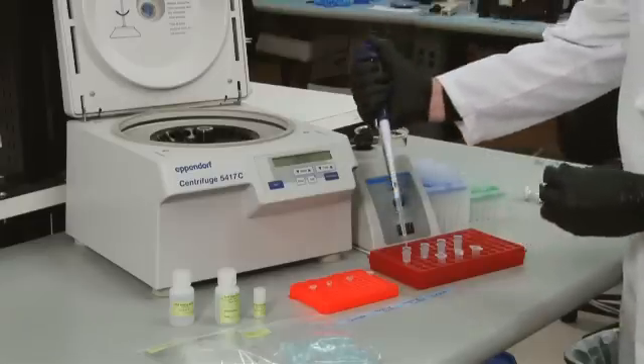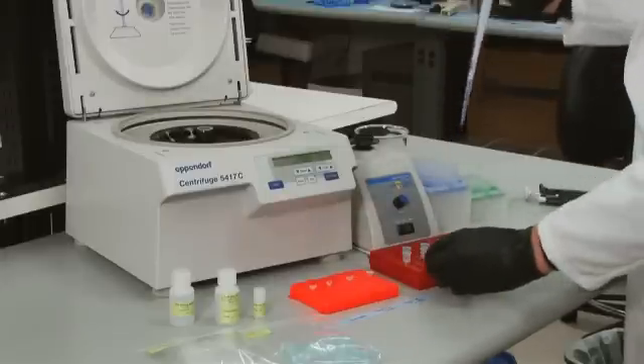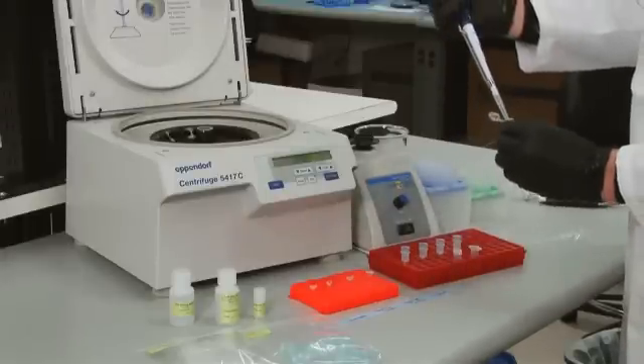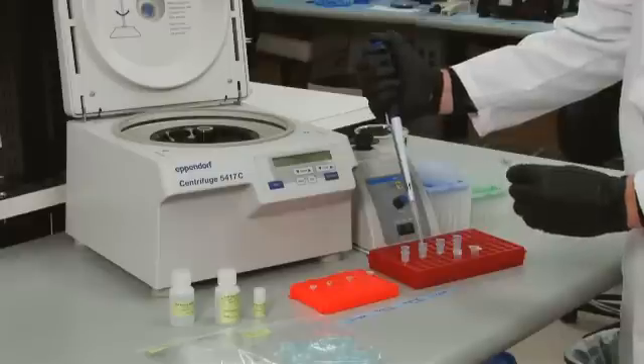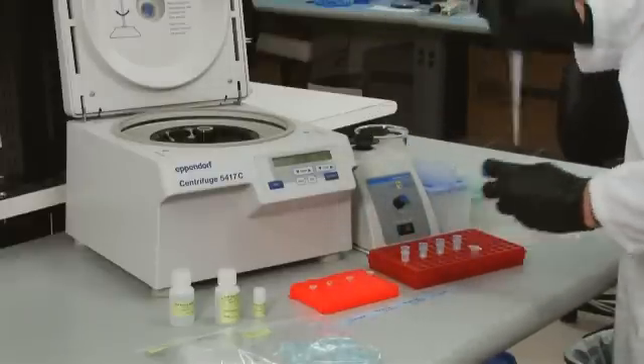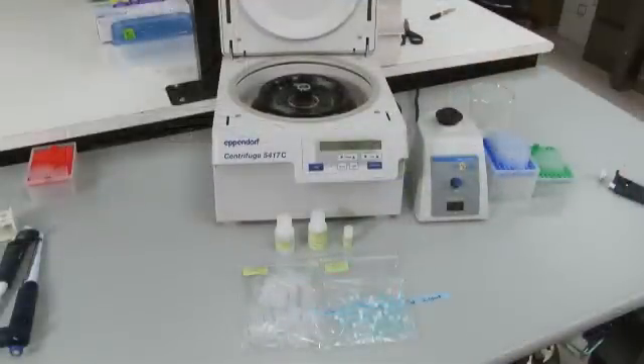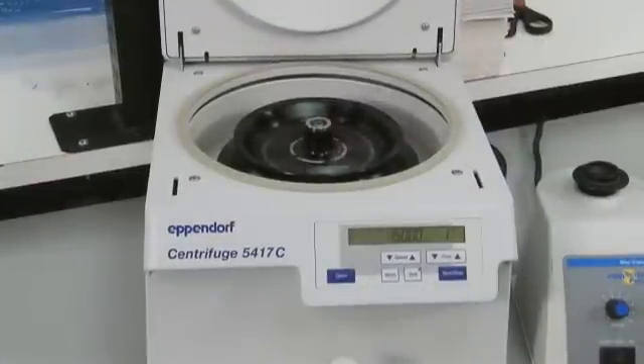To purify each sample, we will use a DNA binding silica column according to the manufacturer's instructions. First, add each sample to the proper amount of DNA binding buffer and vortex. Then, transfer each sample to a column placed inside a collection tube. Centrifuge the columns at 15,000 G for one minute.